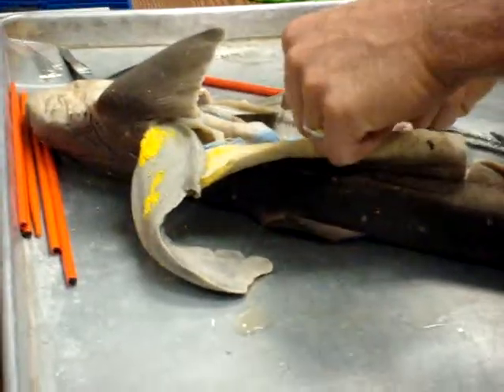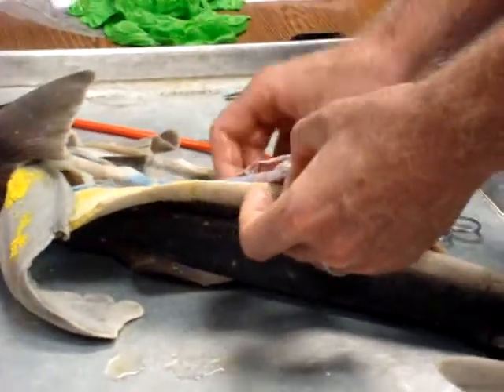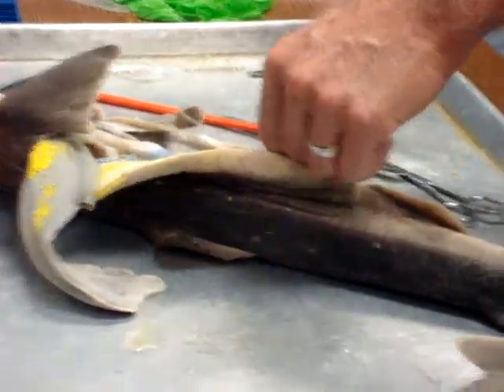I feel bad for Mrs. Margraff. Just put small intestine with spiral valve on there. Okay, so what is this thing? The spiral valve is in the small intestine. That's a spleen. Yes. Okay. Yep. All right. You can go ahead. Thank you, Mrs. Varga.